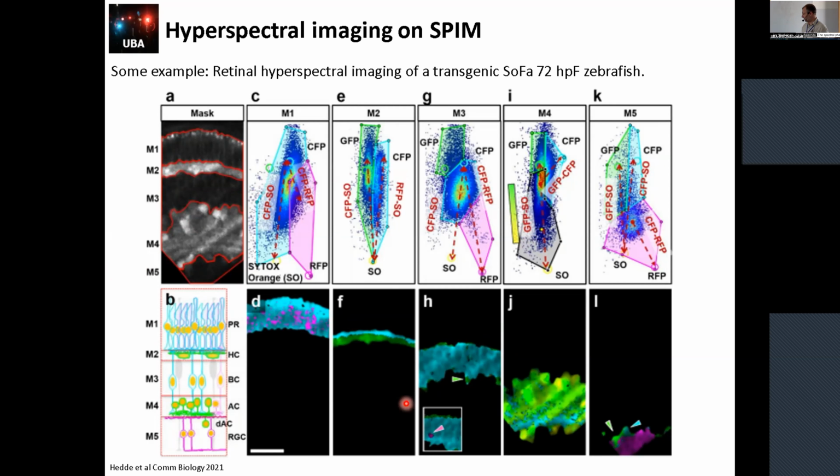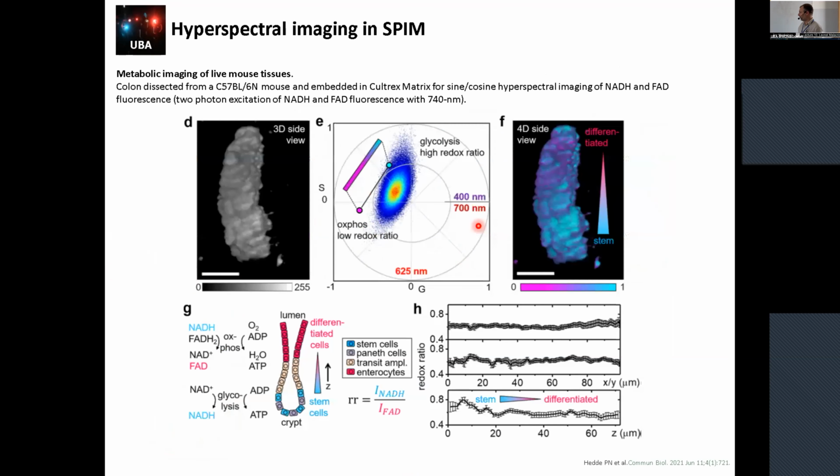And I want to highlight that here we have only one little spot, which is here in purple. And these are this pure amount of pixels here, and the phasor captures very well that these are different locations, which is really complicated in the convolution because if you have 5% of a component, you are going to lose it.